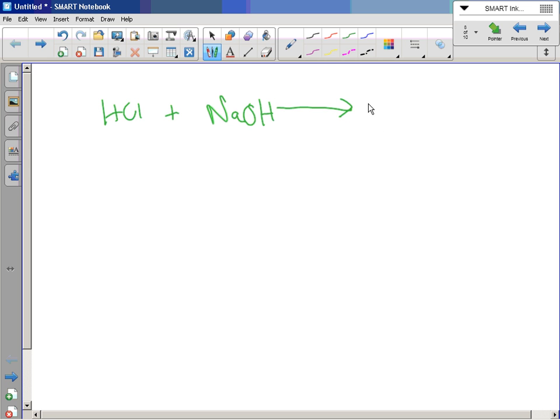Regular balanced chemical equation, NaCl and H2O. Notice we have a 1-to-1 ratio of H's to OH's, so this is a 1-to-1 to 1-to-1. Not exciting. I'll leave these on. Got some chemicals still sitting there. Again, just like we have done in the past, this is 10.00 milliliters because I measured it with the pipette.